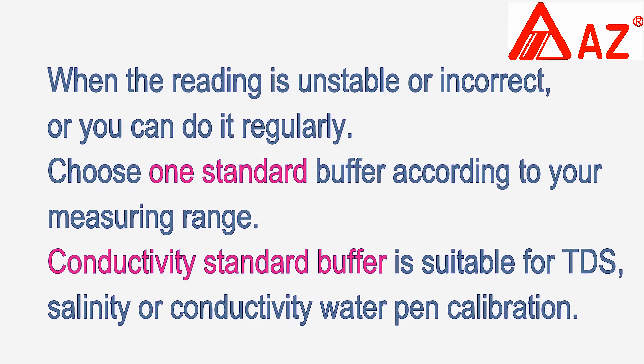Only need to select one conductivity standard near your measuring range. Conductivity standard buffer is suitable for TDS, salinity, or conductivity water pen calibration.